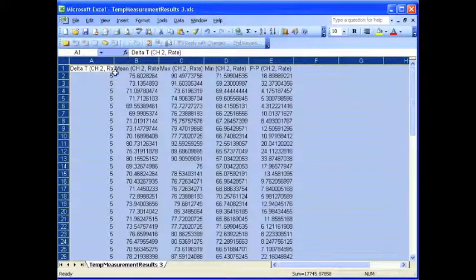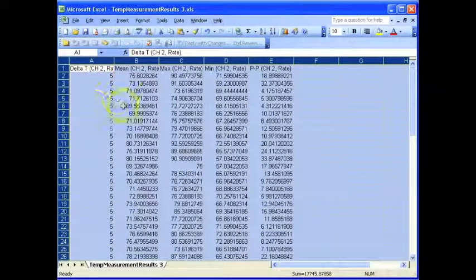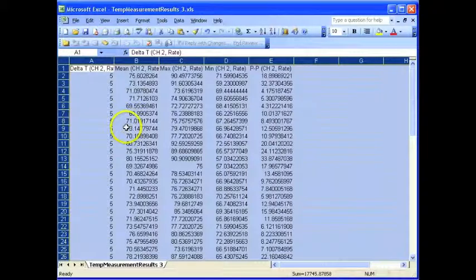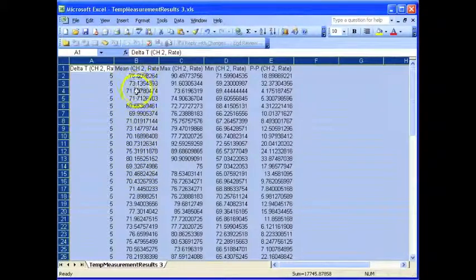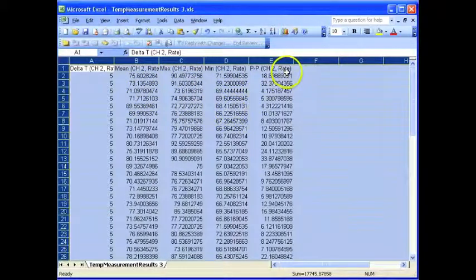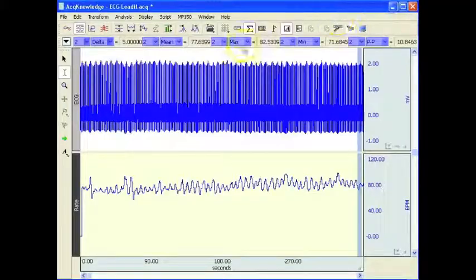If I open this up, we can see column 1: we've got the time period of 5 seconds, the mean value for that 5-second period, the maximum, the minimum, and the peak-to-peak values.